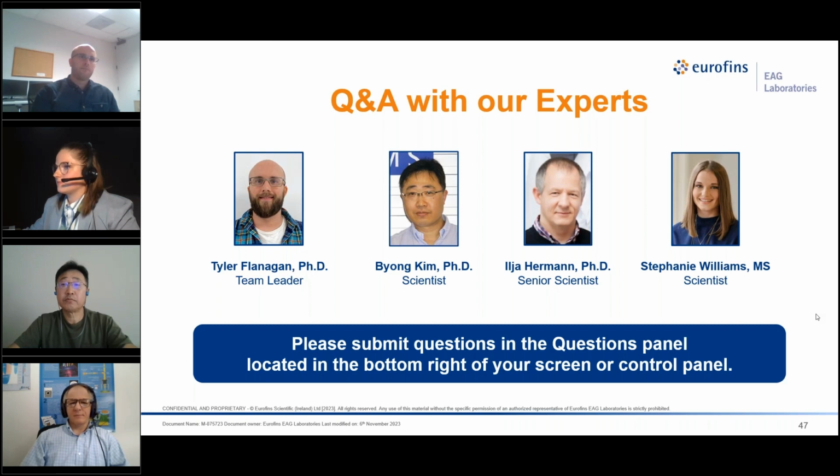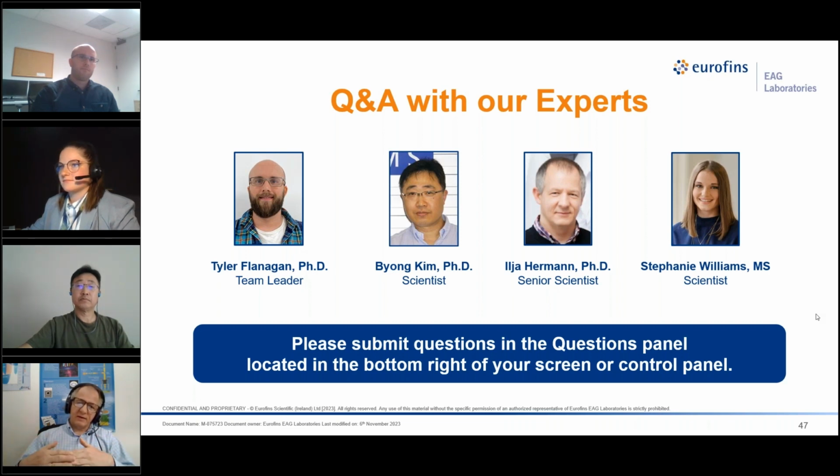So can I take that? Yeah, go ahead. So basically, what happens is the fluid in the surrounding atmosphere gets between the probe and the surface. And if you don't take into account these adhesion forces between these two solids, you will basically falsify the results. So generally, with AFM, you have to take into account these adhesion forces in order to get any accurate results.